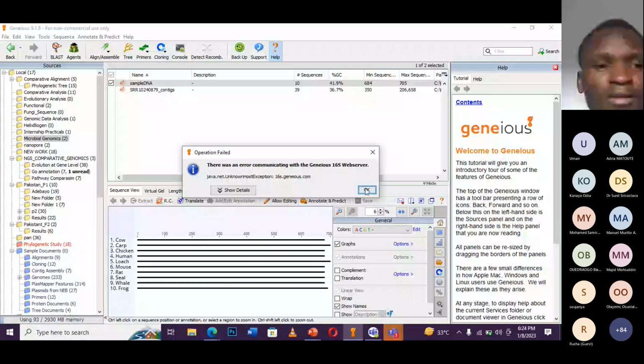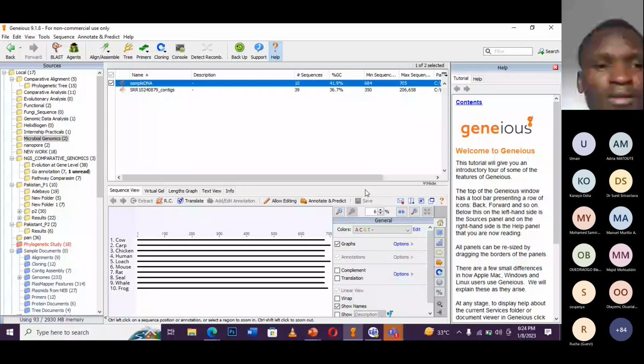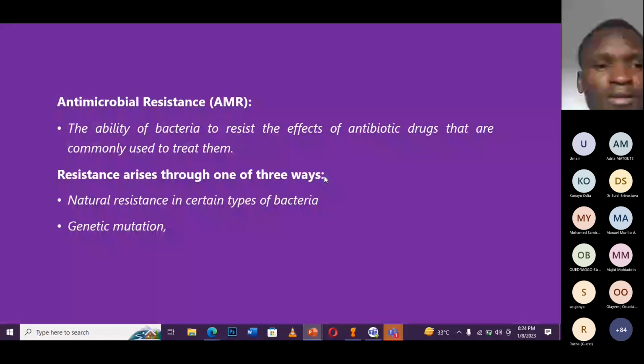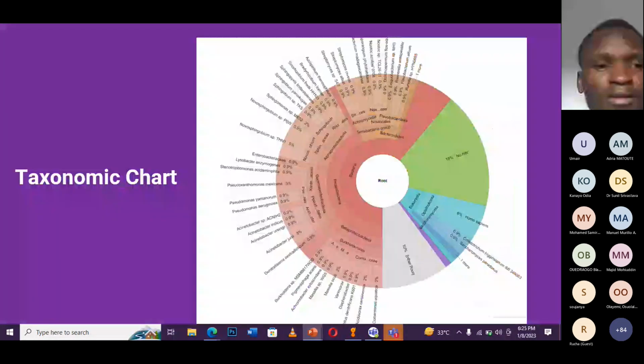We have different pipeline tools for such kinds of analysis to do taxonomy classification, like the one I showed you previously here. You can use the software, but there are other softwares that we are also going to show you how to use. There are other online tools we're going to show you for nanopore reads, and different kinds of analysis that you can run for metagenomics projects.